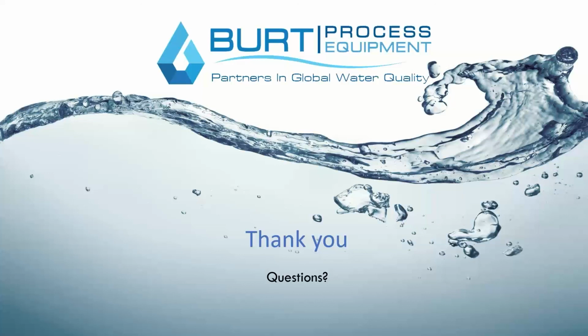That's going to be 360 gallons. You then have your sink usage of say 1 or 2 gallons per hour per day, et cetera. That gives you some value, and that number I would typically multiply by 2. That gives you room for future expansion of lab space, changing of equipment, things like that. You may only really have 1,000 gallons per day, but we'll size a system for 2,000 or 3,000 gallons per day of actual water makeup.